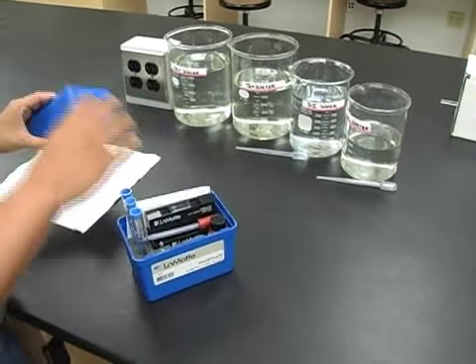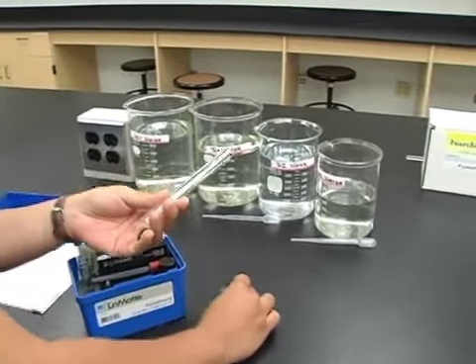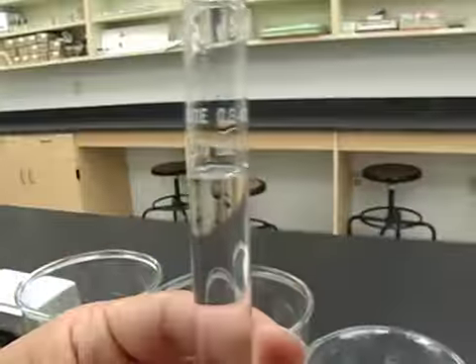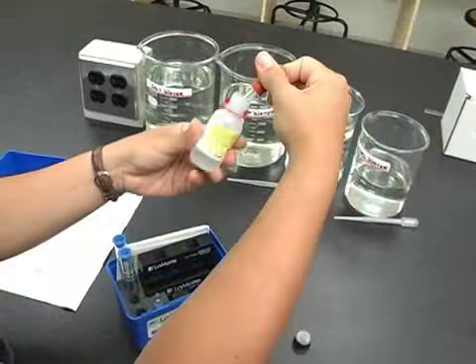The next parameter we will test for is phosphorus, an important element for the growth of plants and animals. However, too much phosphorus in an aquatic system can lead to algal growth, which will deplete oxygen from the system and kill the system. Begin by filling a test tube to the 10 milliliter line with your sample of water.